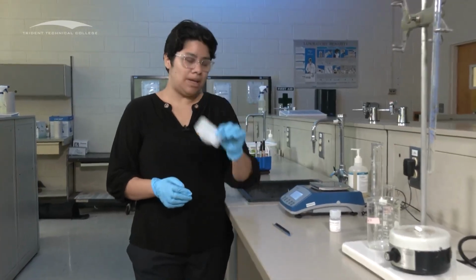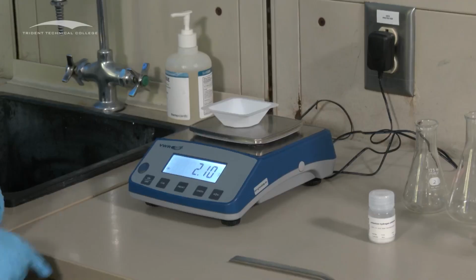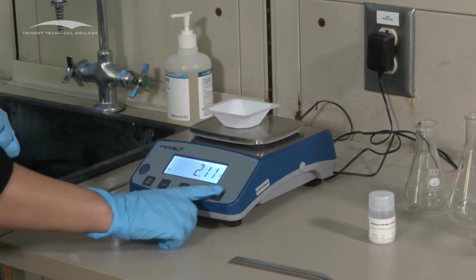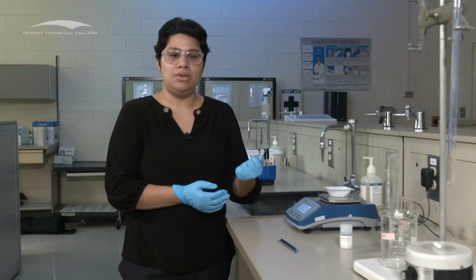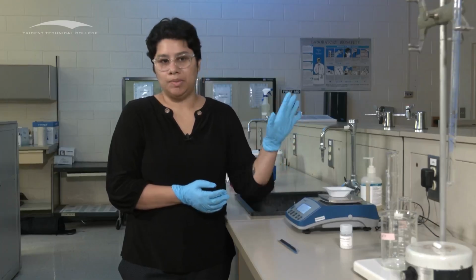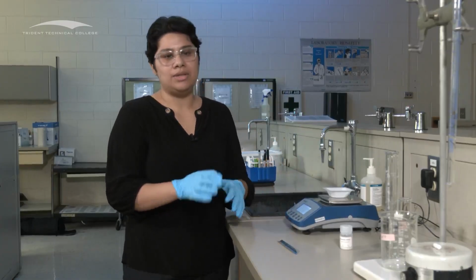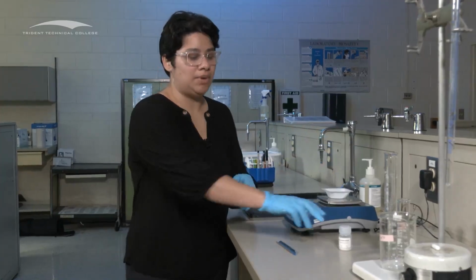You're gonna use a weigh boat, and when you put your weigh boat on the scale, make sure that you tare it. There's a little T, some of them have a 0 on it, so I'm gonna press the little T, and that should give me 0.00 grams. Make sure that every time you use it, you are taring it, because there are multiple people using it, and not all weigh boats weigh the same. So don't assume that because you tared it and I used it, it's gonna give us the same, it won't.